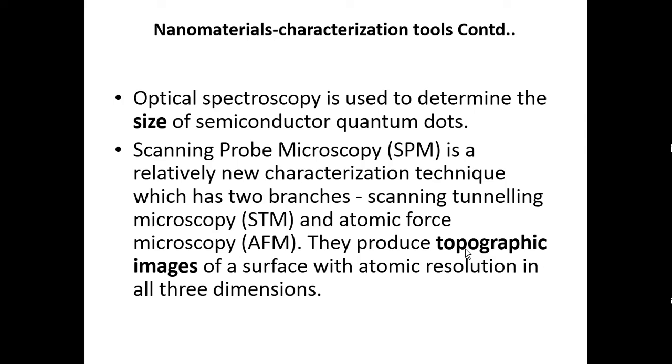So that is why, because it is in nanometers only, some 5 to 10 nanometers or so, such very small size particles are there on the nanometer scale. So these measurements, or the topographic images of the surface, have to be done at atomic resolutions.